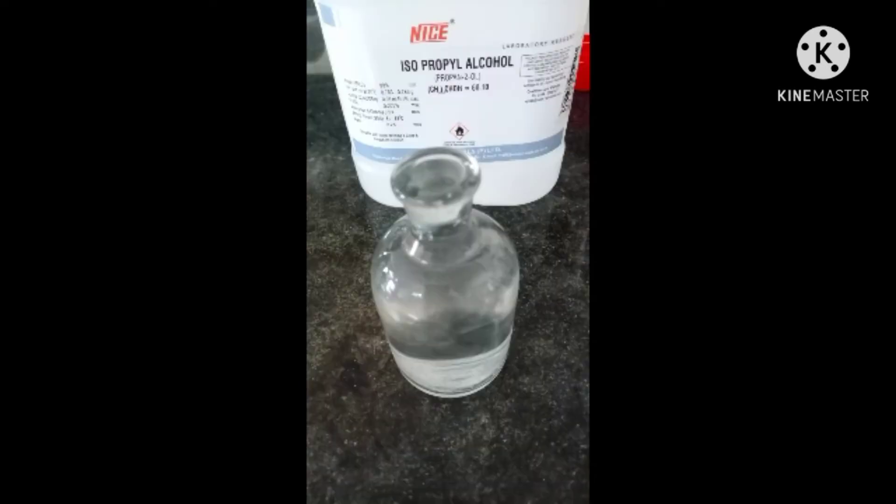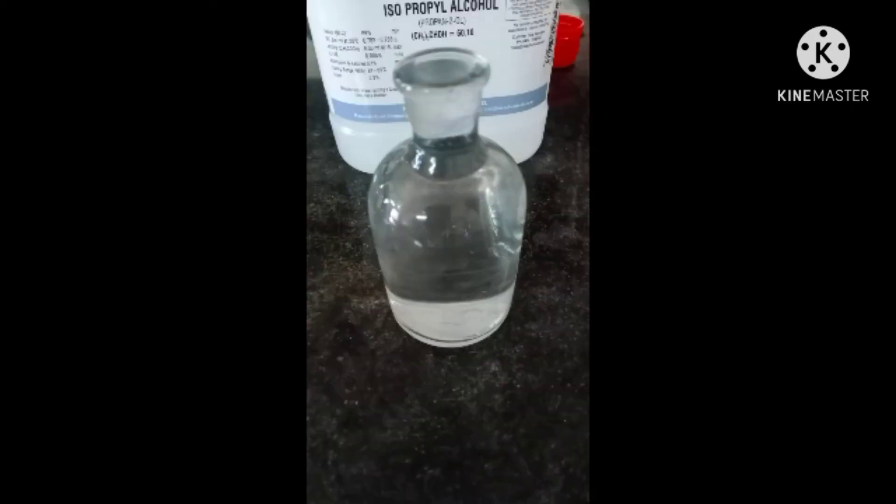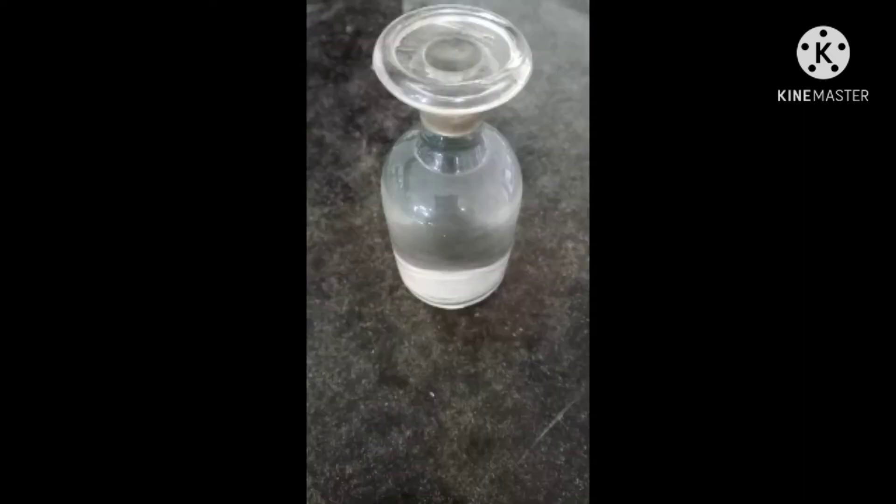Then the bottle is filled with isopropyl alcohol up to the neck. A cork is inserted and the bottle is kept under sunlight to complete the reaction.